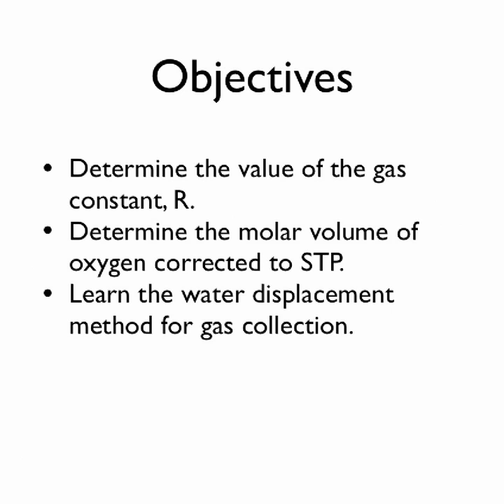Transfer both of these samples into a dry, tared, or weighed ignition tube. The tube may be stained from previous use. It is not necessary to remove these stains. Shake the tube to ensure that the chemicals are mixed well, and then weigh this entire ignition tube assembly: the ignition tube, the potassium chlorate, and the manganese 4 oxide.